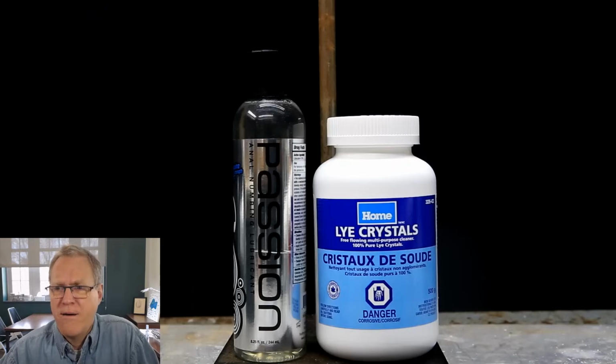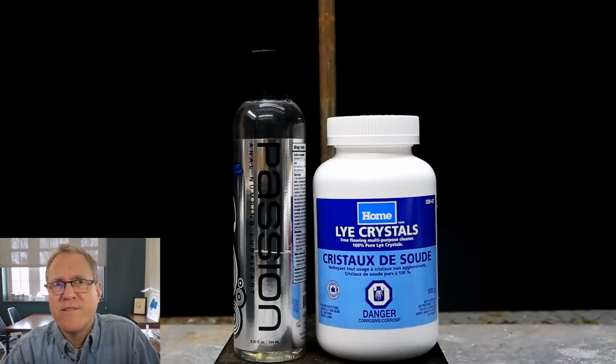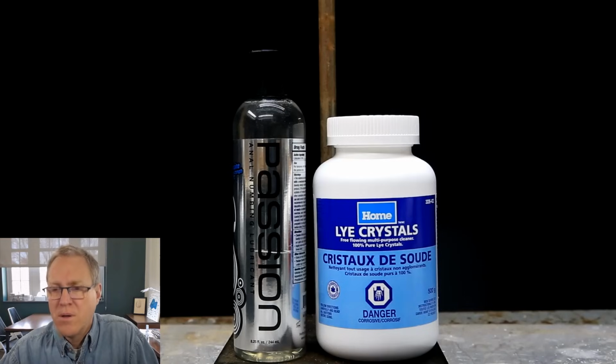Oh yeah. For this experiment, you're going to need some maximum strength anal lube by Passion. Okay, he's going to give us 2 reasons why he chose this specific product, and these are going to be important details. This is the best product for extracting lidocaine because it has the highest concentration of 5% and it has no emulsifiers or surfactants.